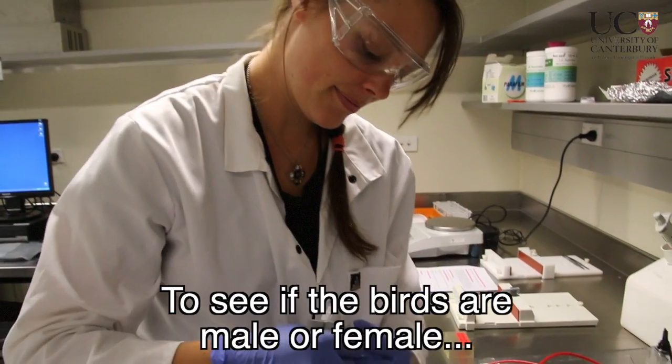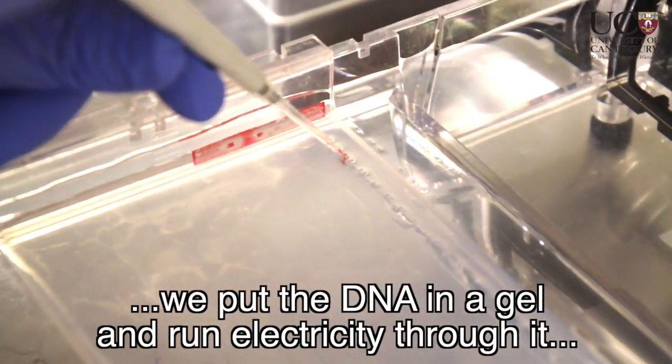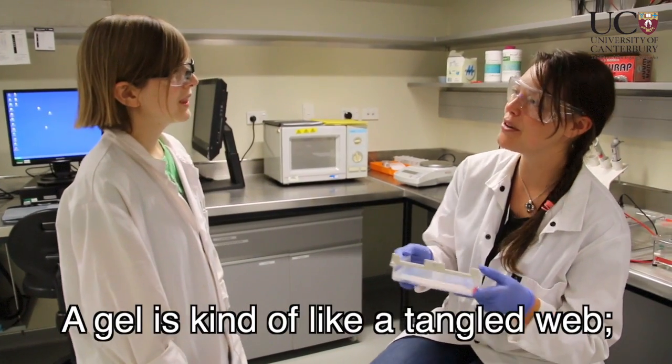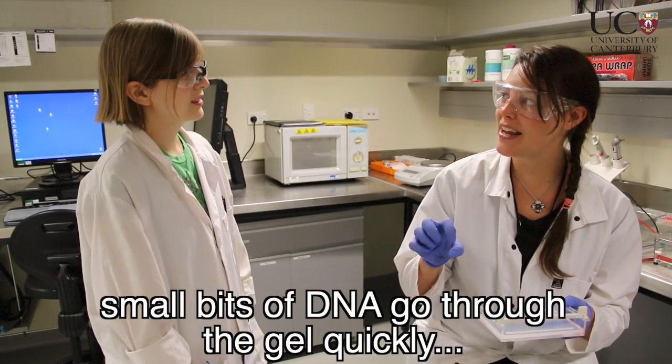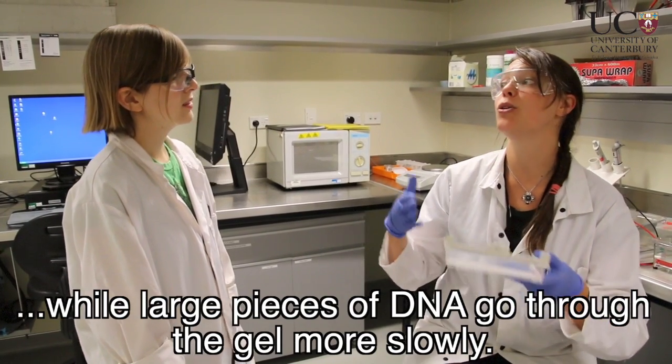To see if the birds are male or female, we put the DNA in a gel and run electricity through it to separate pieces by DNA size. A gel is kind of like a tangled web. Small bits of DNA go through the gel quickly, while large pieces of DNA go through the gel more slowly.